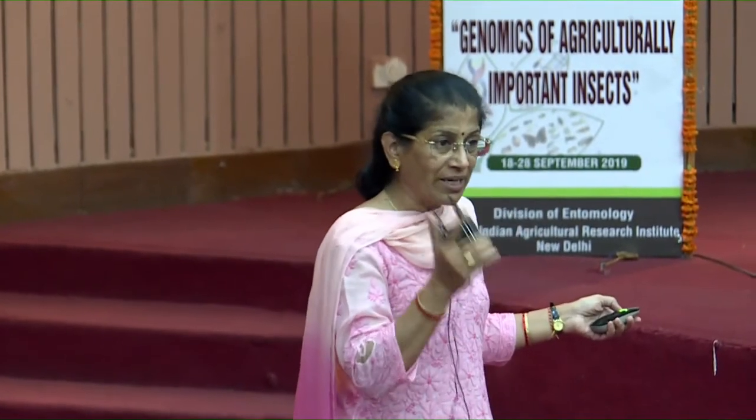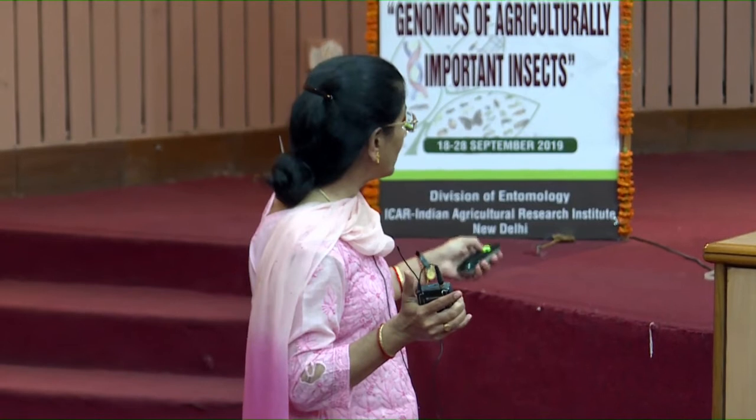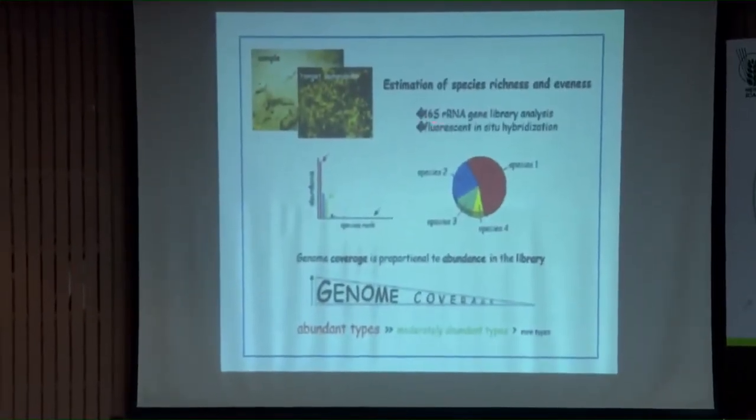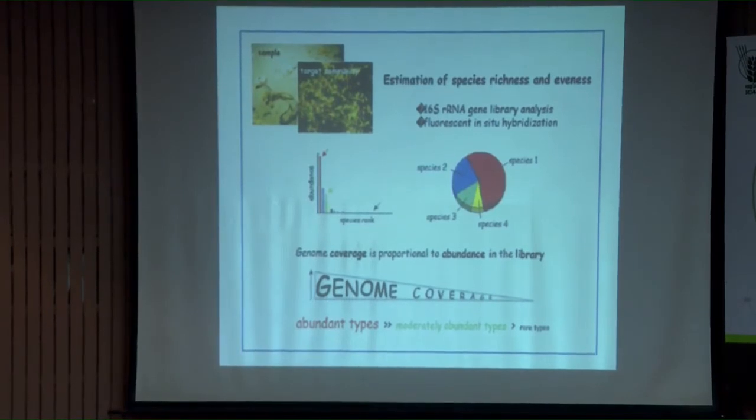Now, one thing you must again remember is, when we are talking about metagenomics, like I said, structure is how many organisms are there in that community. That structure you can look at by the species richness and the evenness. If I am talking about bacteria, then I will concentrate on 16S rRNA gene analysis. Again, if I am looking at 16S rRNA gene analysis, it can be so many different types of bacteria, isn't it? There are special software and you can analyze; you must have heard about Shannon diversity, alpha diversity, beta diversity, Chao diversity, Chao analysis.